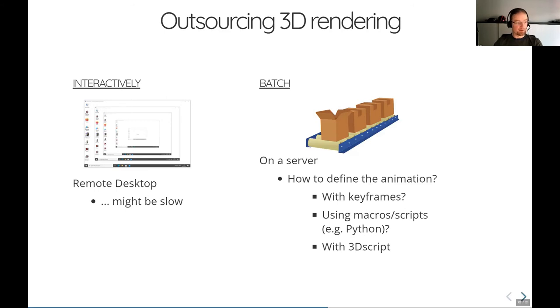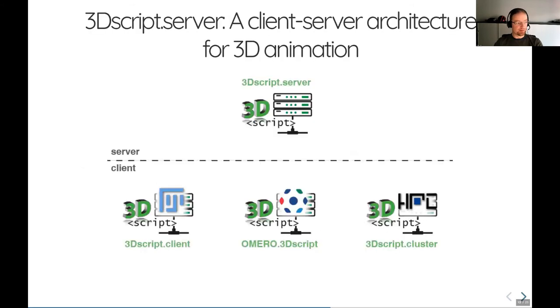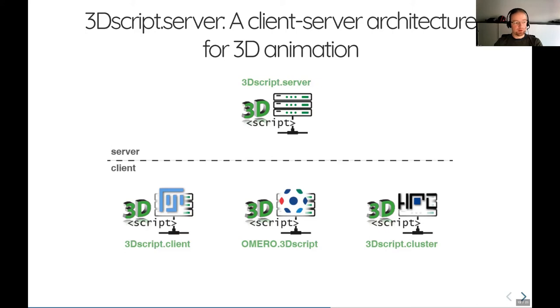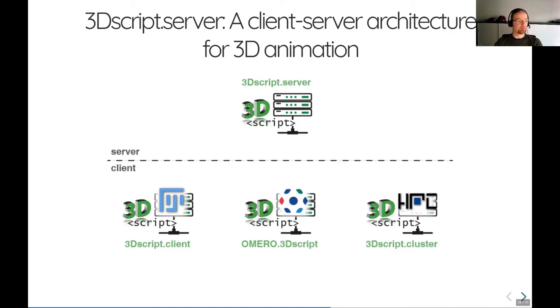So we implemented this idea. We called it 3D script server. It's a client server architecture for 3D animation, and it consists of the server itself, a 3D script server, and three clients: one for Fiji, one for Omero and one for cluster processing. So let's quickly look into these.